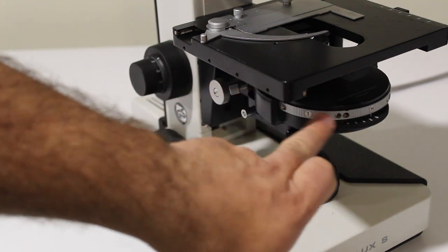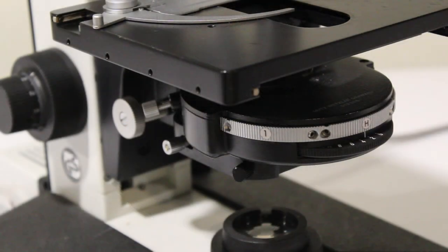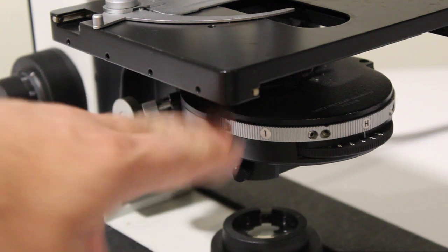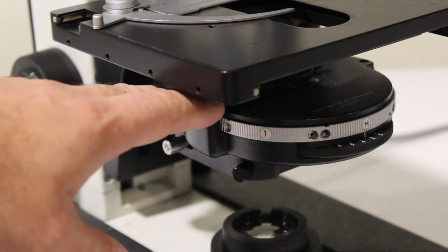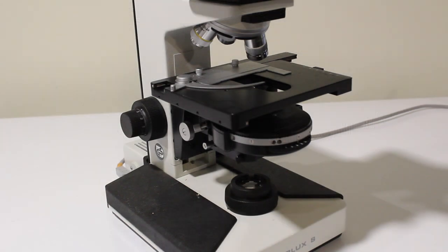This is a key element for getting good images, and that's why I would always recommend you get a microscope that has a condenser. Not all microscopes will, and ones without a condenser are generally not good for microbiological work. The condenser is a complex component of the microscope. Adjusting it and using it properly is difficult, so I actually have a whole episode later in the series that's pretty much dedicated on how to use this properly.